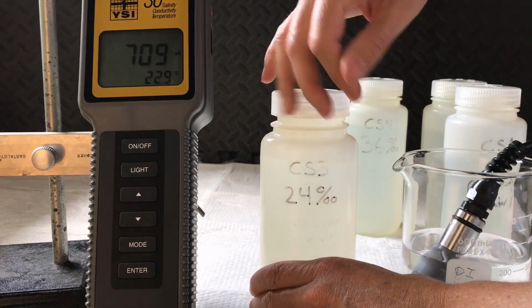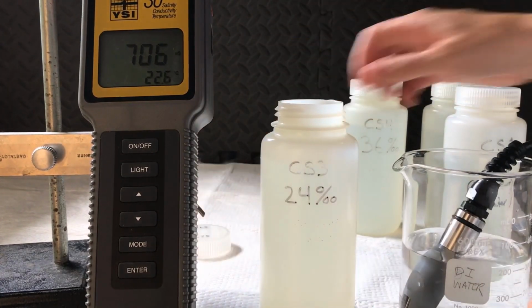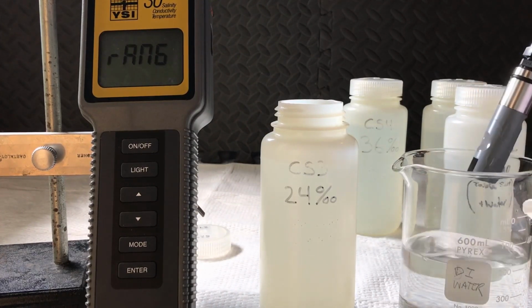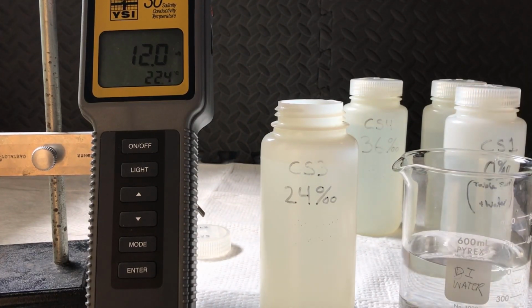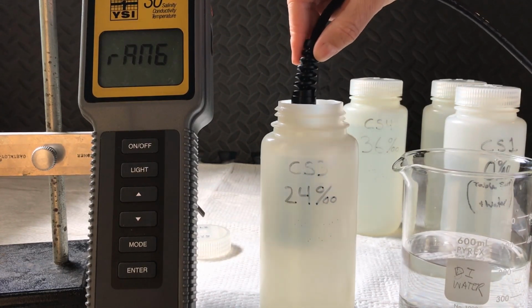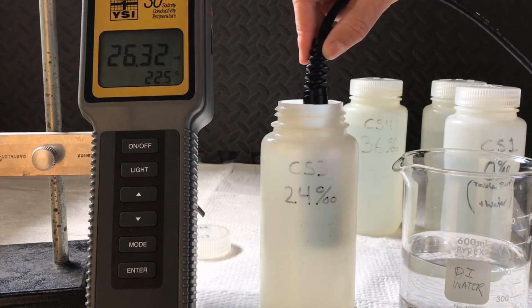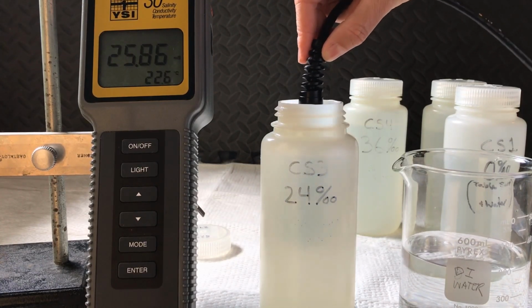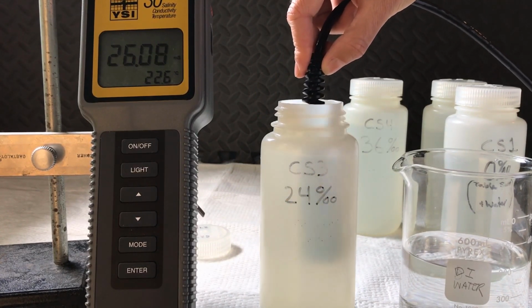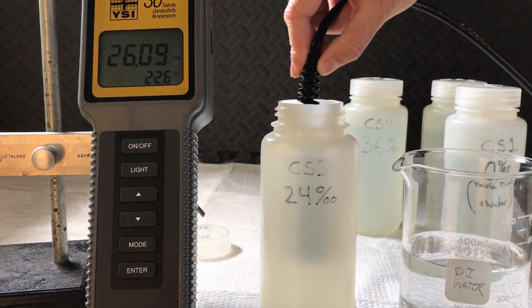Calibration standard 3 has a salinity of 24 parts per thousand salt. So we're changing units. We're now reading in millisiemens. So the conductivity of calibration standard 3 is 26.08 millisiemens.